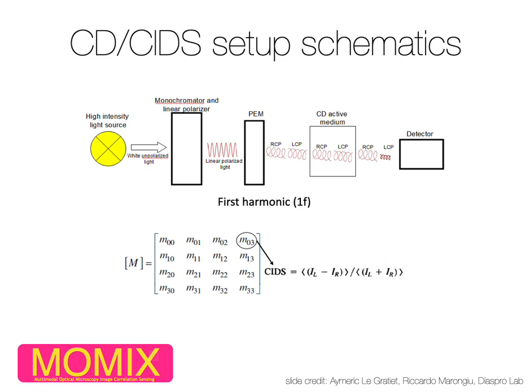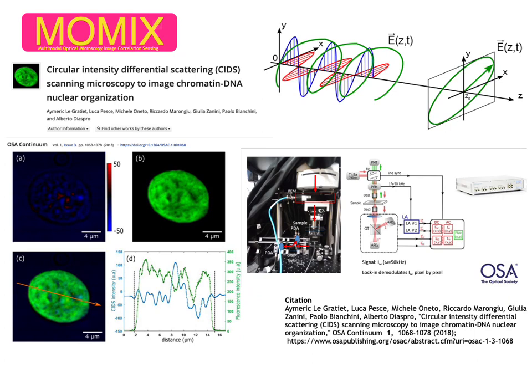Now, simply to let you know, I'm sure you already know about this, DNA has the propensity to have a helical structure, this is the organization, that can be superhelical. And this, inside of the cell, can be monitored by fluorescence using some fluorescent molecules that, according to the intensity, tell you something about compaction. Here you see a demonstration, but we have to be more careful on the kind of signal we're going to record in this case: in the blue image, a signal that is sensitive to radius and pitch, so compaction less or more, and fluorescence, where the green intensity is proportional to the level of compaction.